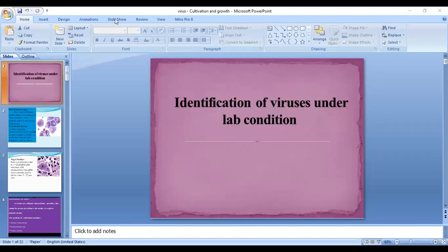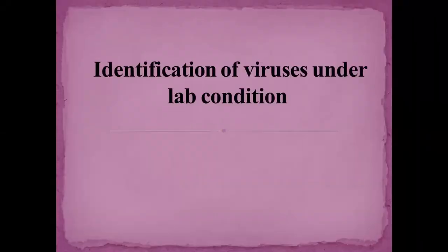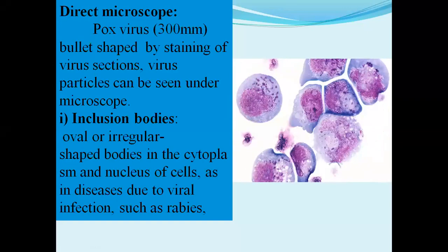Now, today's topic: we are going to discuss the identification of viruses under laboratory conditions. How can we identify the viruses under laboratory conditions? Some viruses can be observed directly in our normal laboratory microscope.